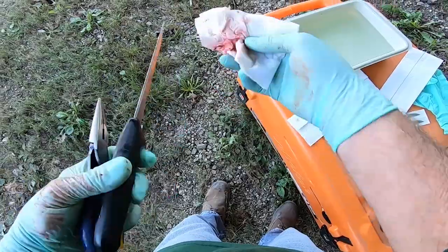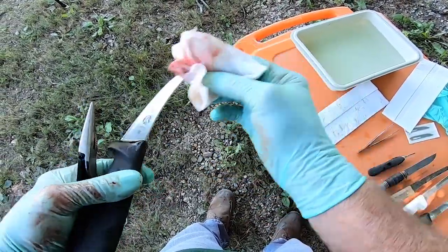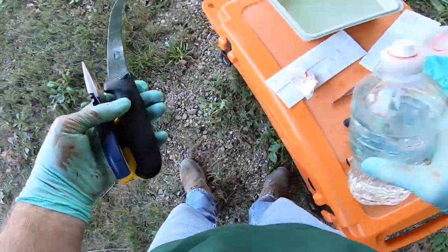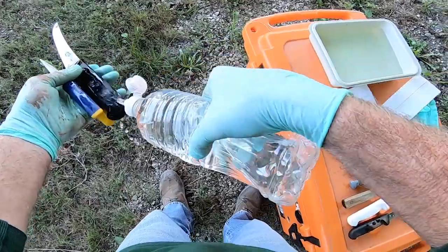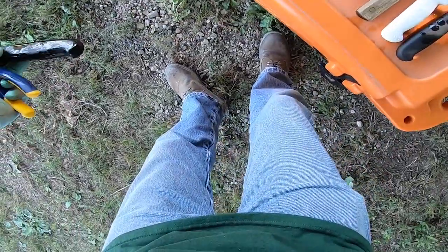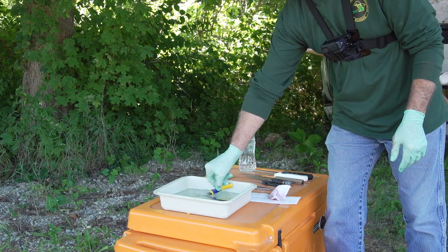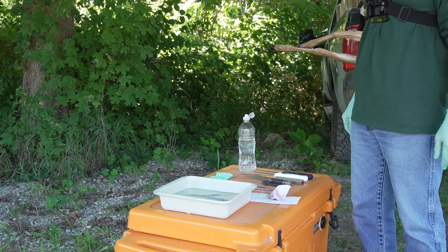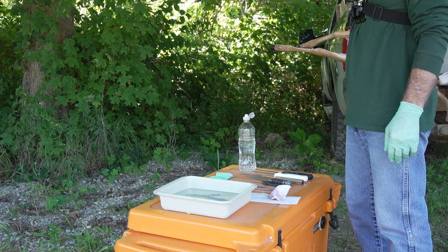In 2019, researchers with the National Institutes of Health confirmed that bleach can be an effective disinfectant for CWD prions on stainless steel surfaces. However, bleach may be ineffective if blood or tissue is present, so tools need to be rinsed to remove any organic material before soaking them.